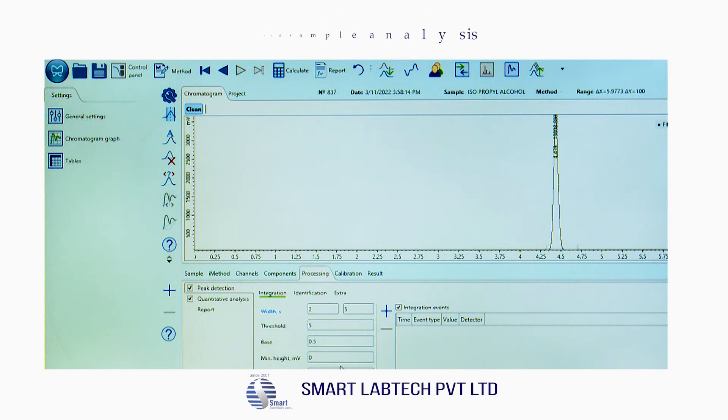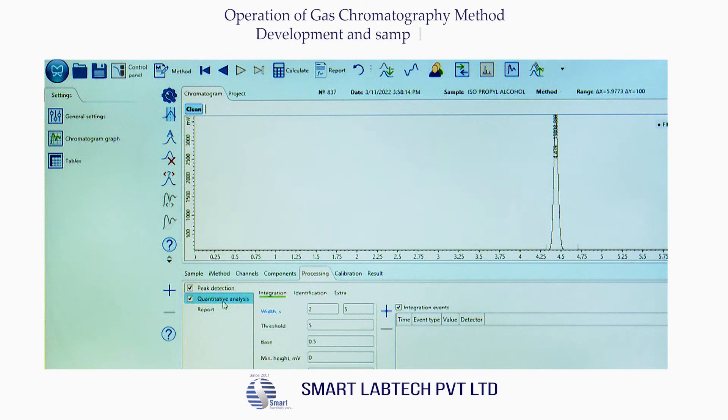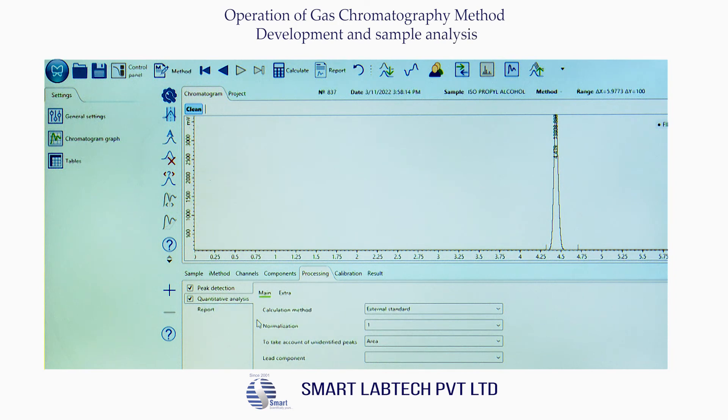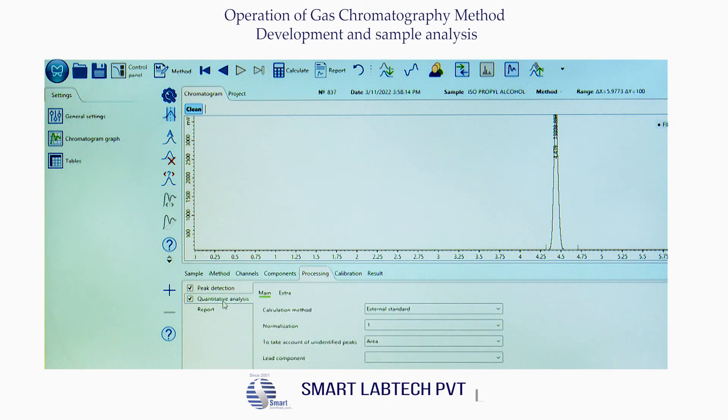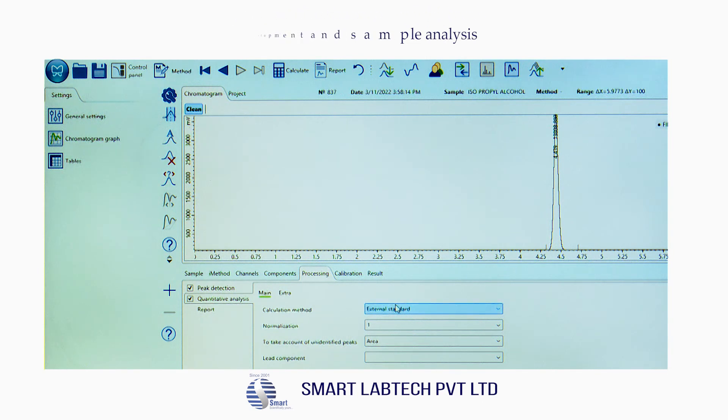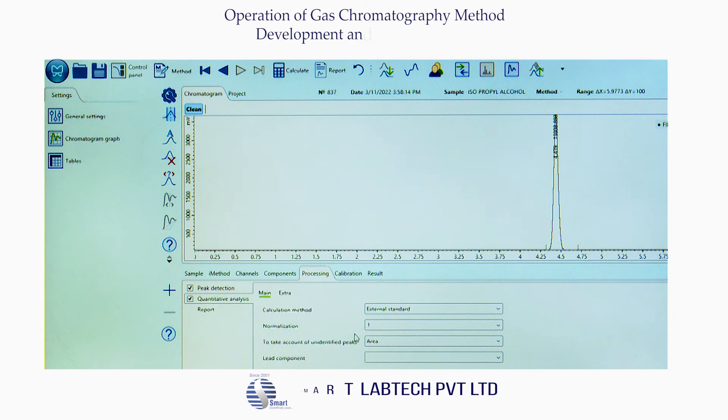Leave the minimum height blank if not required. Now under quantitative analysis, click Main. Under calculation method there are four methods available: internal standard, external standard, area percentage, and area normalization. Select external standard. Under normalization, select 'area' to take account of unidentified peaks.